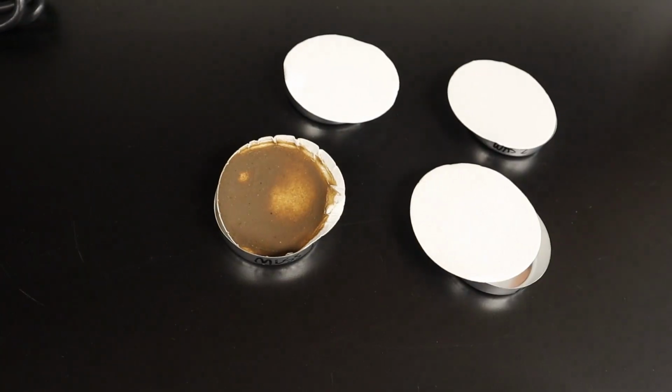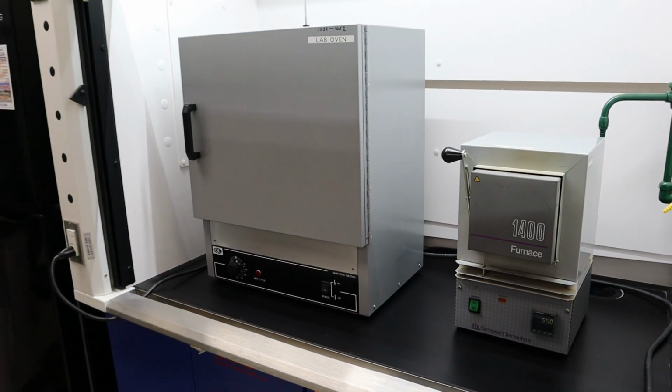Matt with Operator Mindset here, and in today's video we are going to be talking about MLSS, or Mixed Liquor Suspended Solids. If you don't know what that is, you're about to get familiar with it. And in this video we are actually going to be running a mixed liquor suspended solids test. So we are going to be weighing the solids, running them through a filter, and cooking them in the ovens behind me.